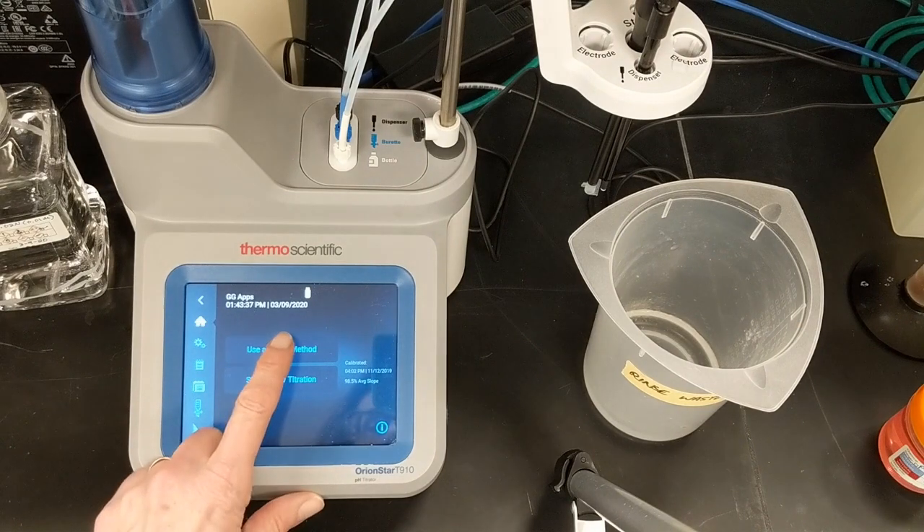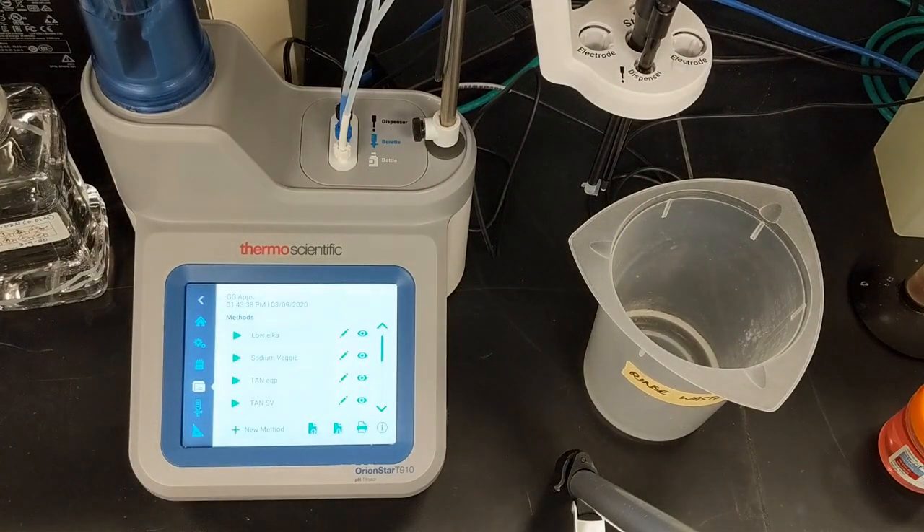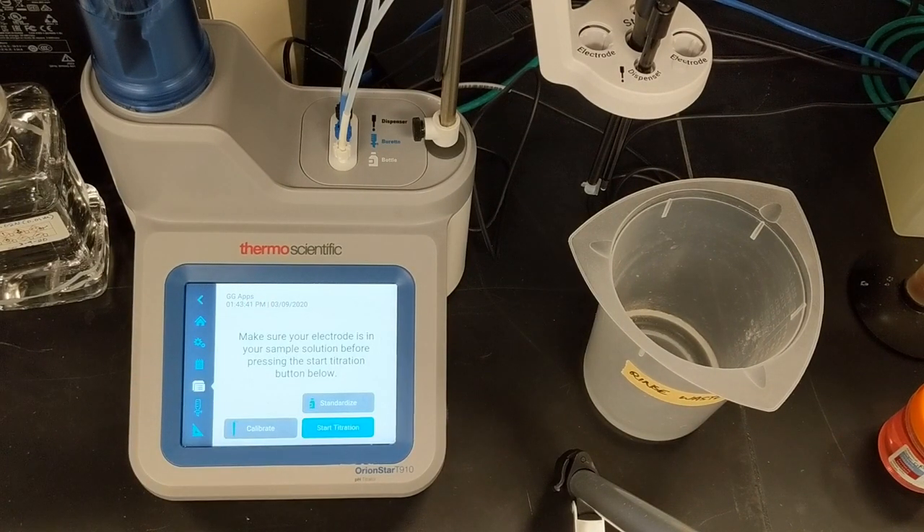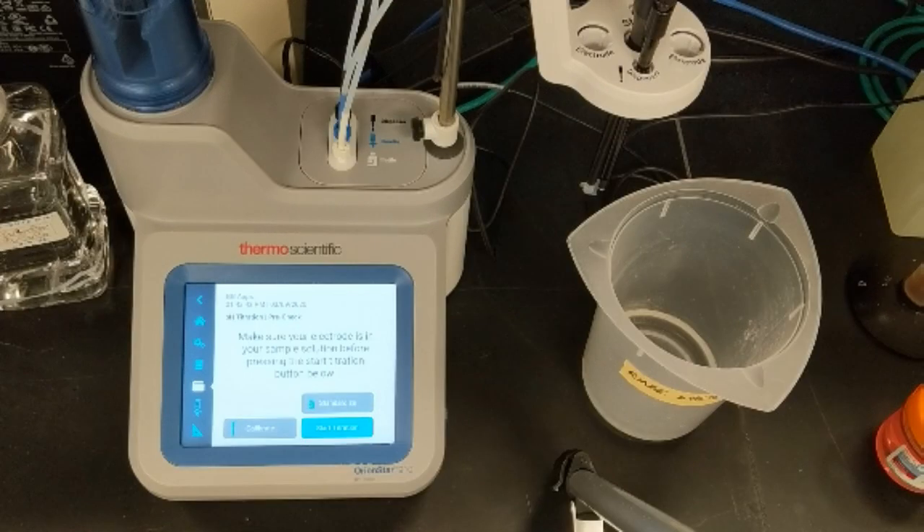To run the titration, I'll use a saved method and select the low-alka method in the method screen. That brings us to the titration pre-check screen, where we can see options to standardize, calibrate, or start our sample titration.